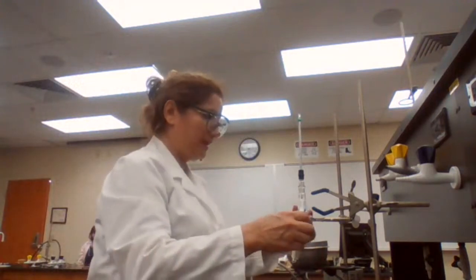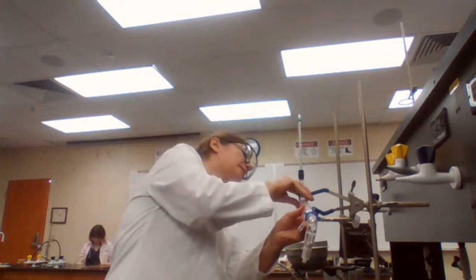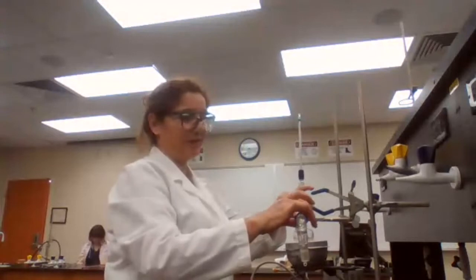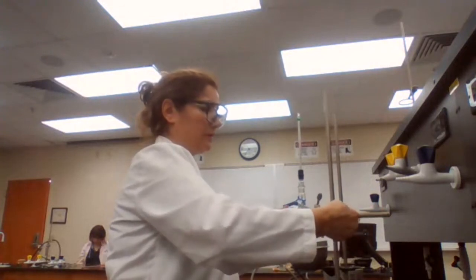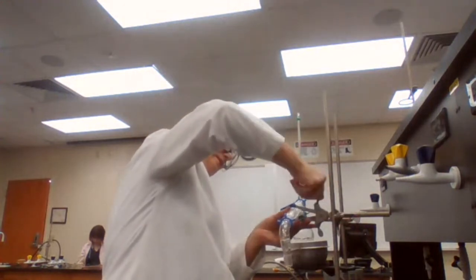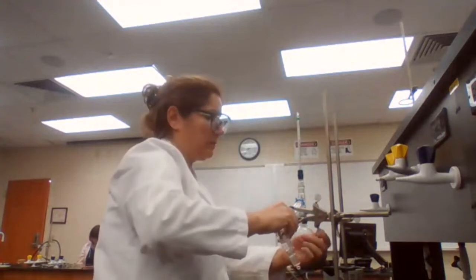So we just connect this and use the clamp. These clamps are not strong enough to hold the weight of the condenser. We want to make sure that the condenser is secured using this 3-finger clamp.